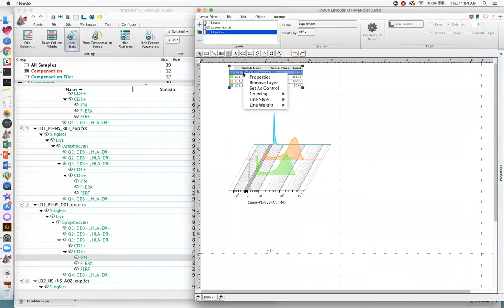So pretty much if you just right-click on whatever it is that you're looking at, a lot of times you'll find the tool that allows you to change a lot of things about it, right? We could have it so that it's not tinted, or fully tinted, stuff like that.